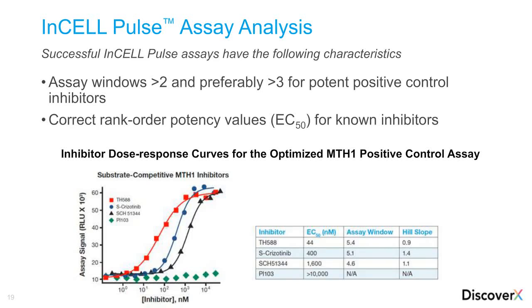So after you're done with this, you're finally happy, the main experiment went well, you can go ahead and generate your stable cell lines. Or if you want, you can definitely continue to do transient transfections to test other conditions and targets, etc.